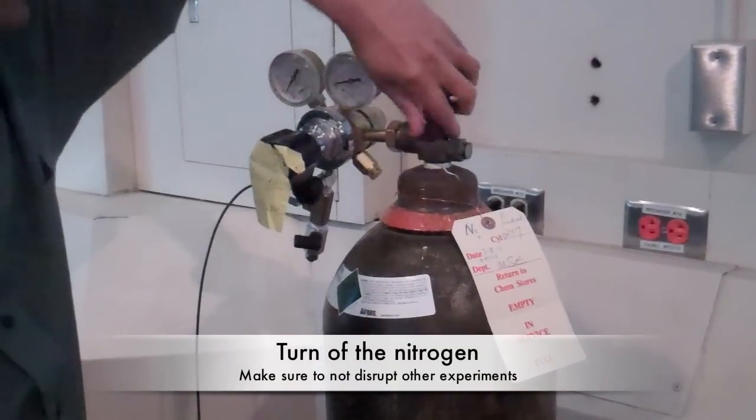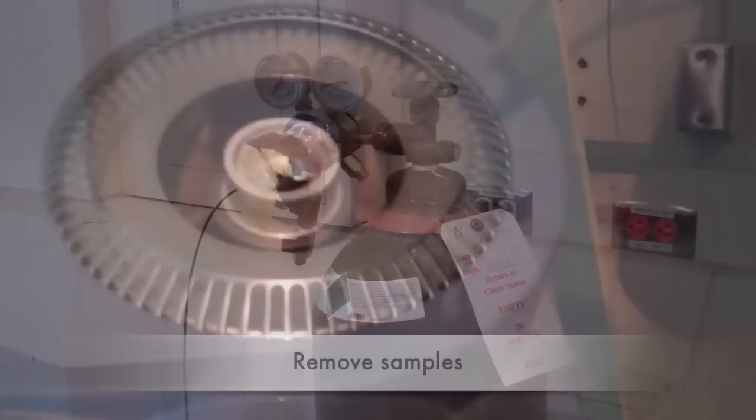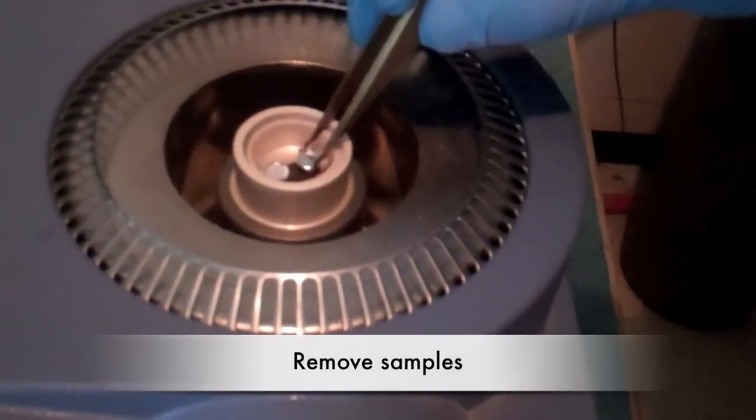When your testing is finished, turn off the nitrogen. If the TGA is being used, then just turn off the knob for your machine. Remove all samples from the DSC.